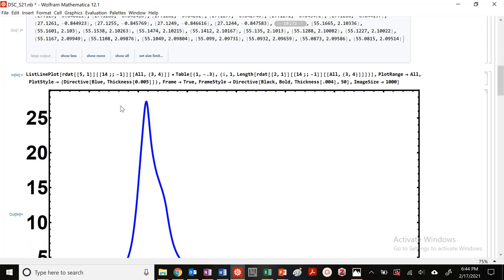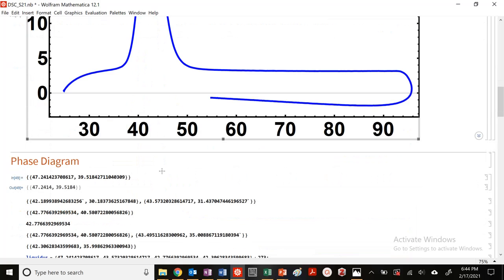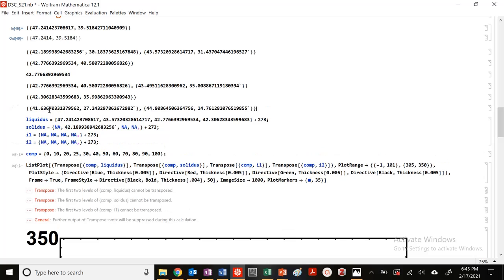One of the ways that we could improve our data set is by going at a slower heating and cooling rate. So I'm going to Control C here, I'm going to Control C here, and again, this is my lower temperature, so this is going to be my solidus, again, finally, and then my liquidus, highest temperature peak, going from solid to liquid, it's going to be right here. So you could start to plot this. I'm going to do Na. Actually, I'm going to stop. Do Na. Get rid of this, get rid of this.